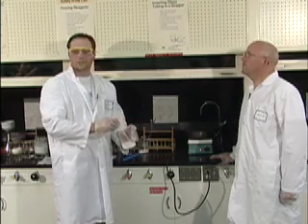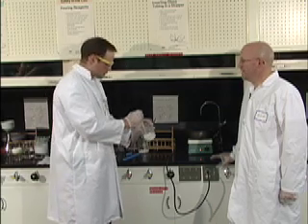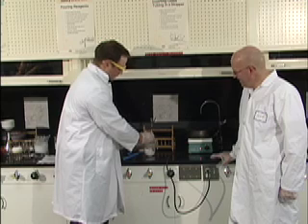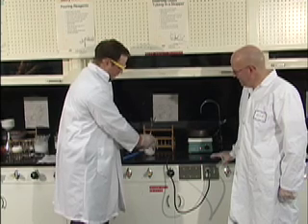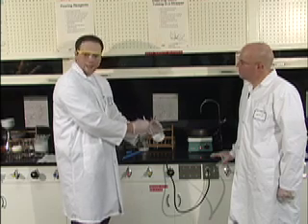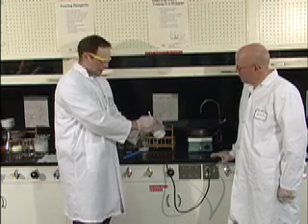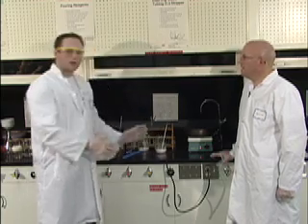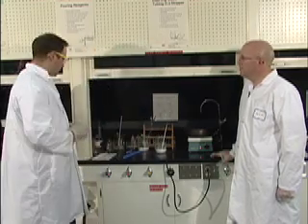Don't use a glass spatula for this. It makes sense, but some people do. Okay, and you want to break this up into bits. Lots of tiny little bits, and you want to make sure it is a fine sand. Almost sand-like. So no big pebble kind of things? No big pebbles. We want sand, smooth white sand in the bottom of your beaker.